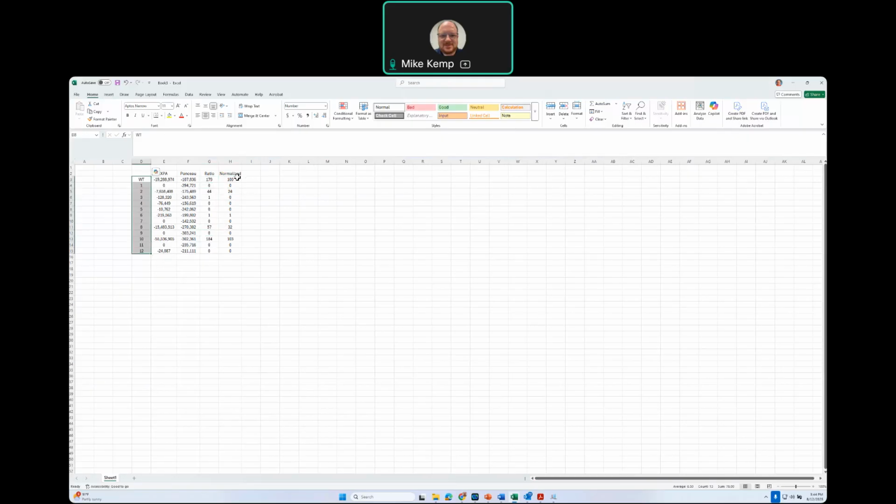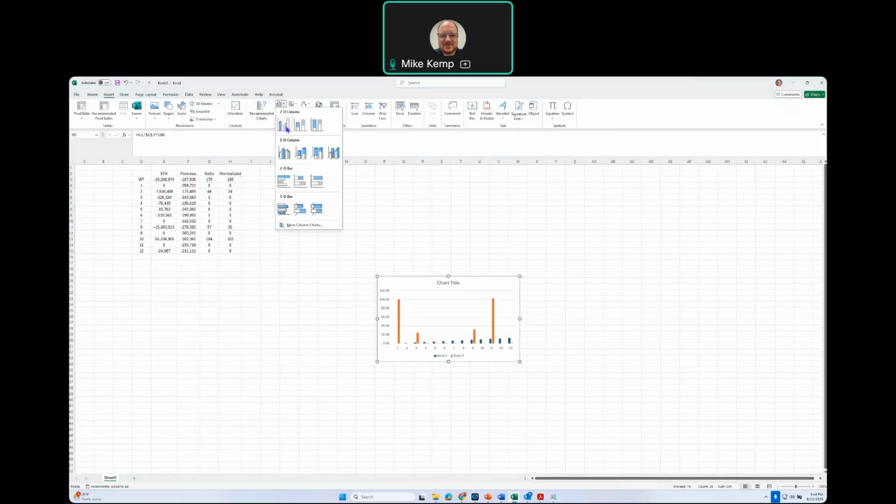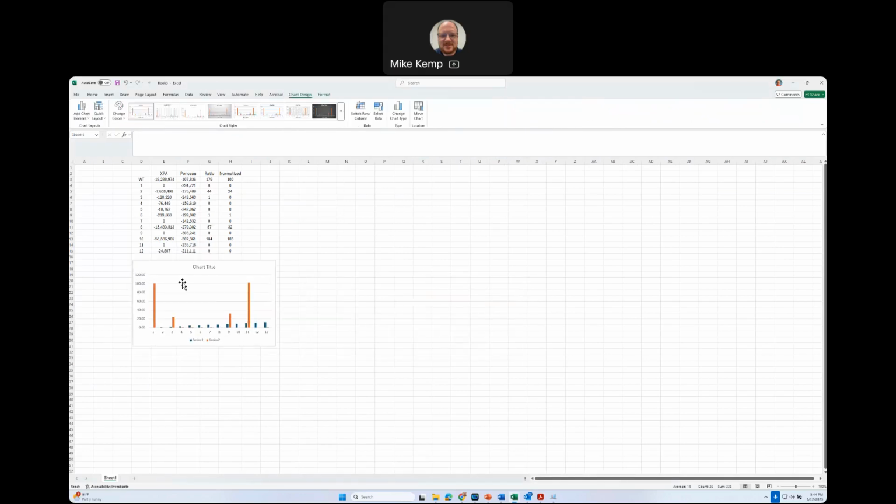Now let's graph the data. We'll scroll down there and hit Control and select the other set of data. The wild type and cell line number will be the x-axis, and this will be the y. Then we're going to insert just a regular graph. Because of the numbers, sometimes it will put both in there, since it thinks they're two types of numbers you're trying to graph. So we're going to select data.